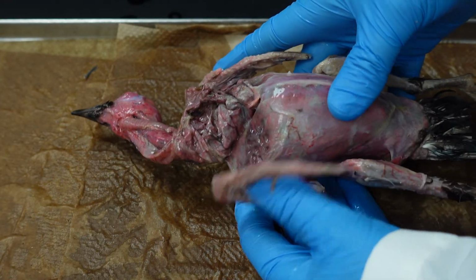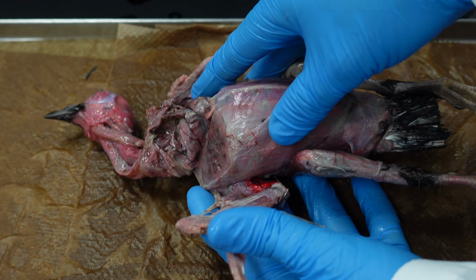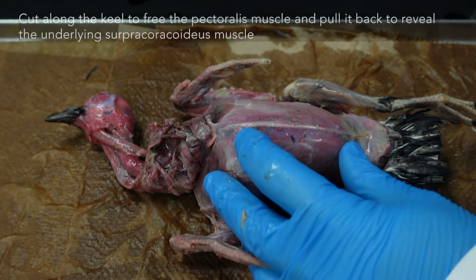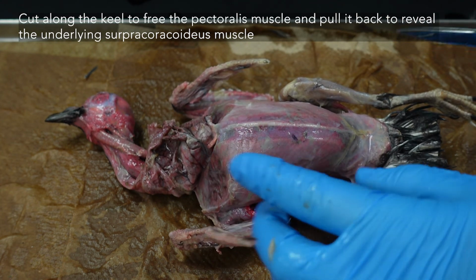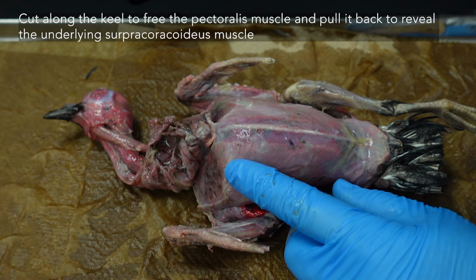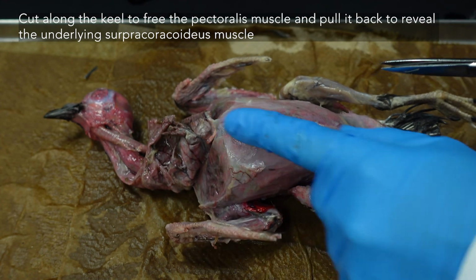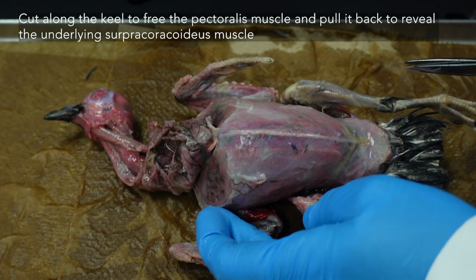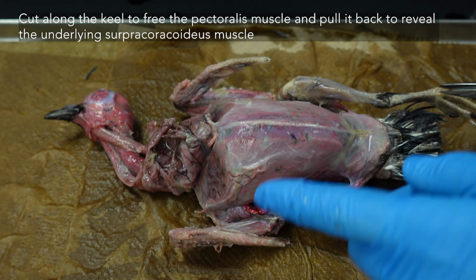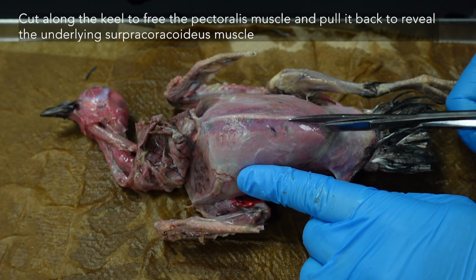A large percentage of a bird's weight is in the pectoral and supracoracoideus muscles. Well, at least in flying birds. So these huge, enormous muscles are going to be the first you'll separate. Take your scissors and cut along the keel. And you're cutting so that you're folding your pectoralis muscle back. You're leaving it connected around the shoulder, but you're folding it back from the keel so you can see the supracoracoideus underneath. So just cut that muscle right along the keel.